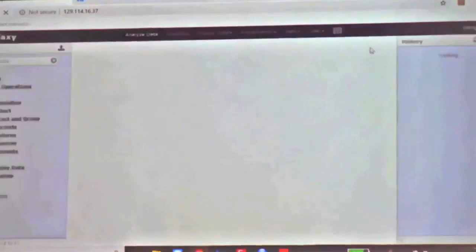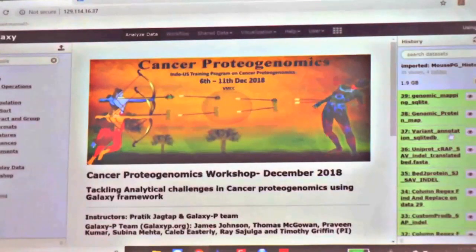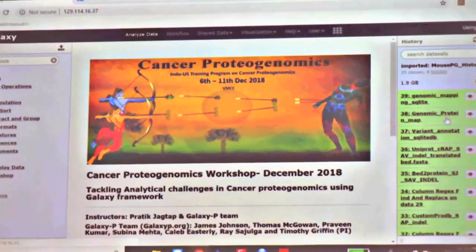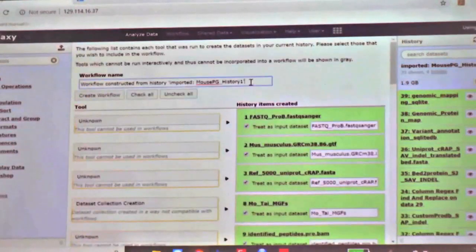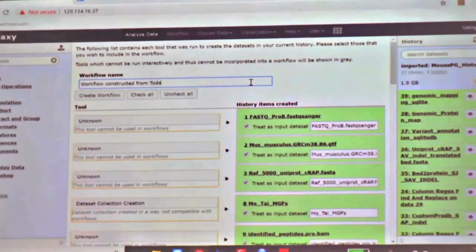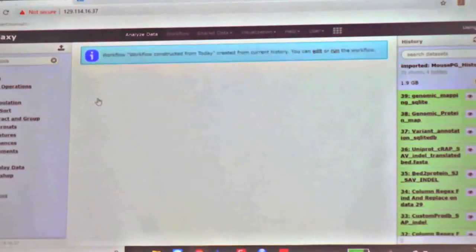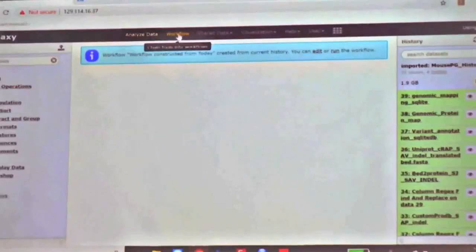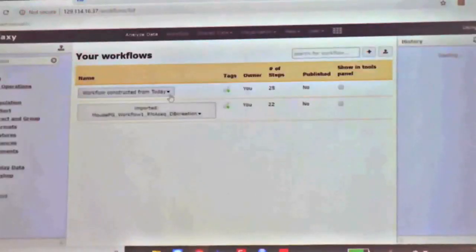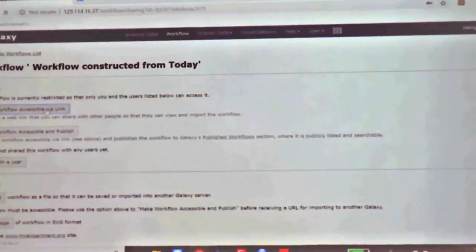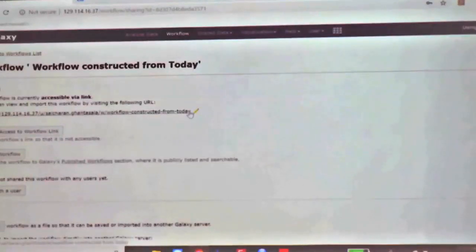I just want to mention that if you have a completed history, you can convert it into a workflow — this is a little advanced, but let me just show you. You go to the wheel icon and say extract workflow, name it, then say create workflow and it will generate a workflow. You can then share this workflow with anybody on the same Galaxy instance — just generate a link and send it by email. If they click on that link and log in, they should be able to open that workflow and use the same parameters.